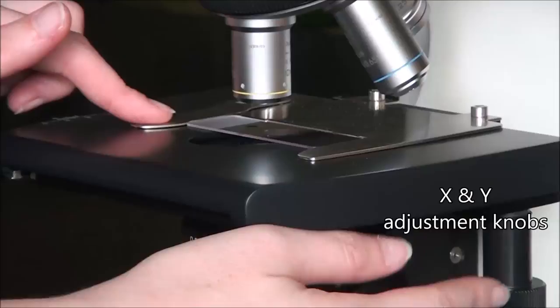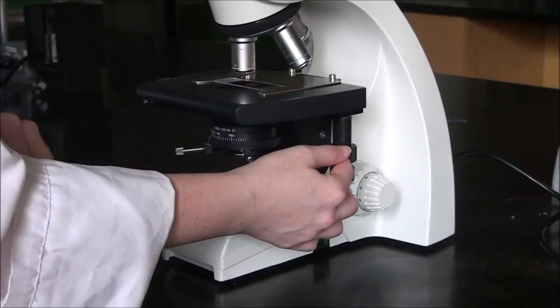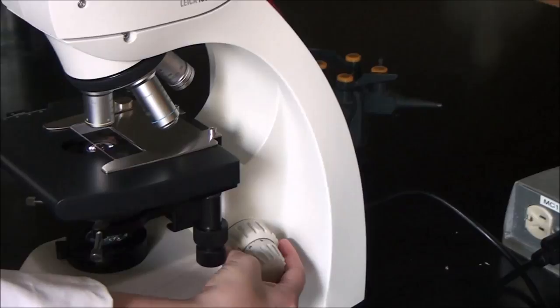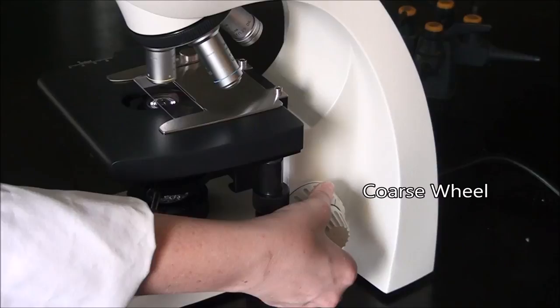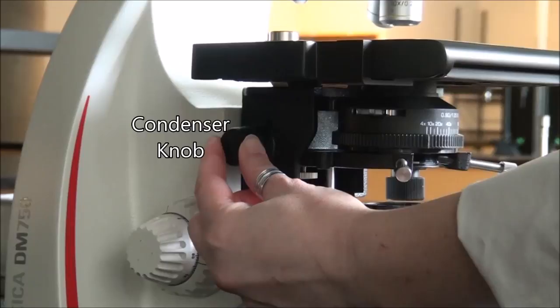Raise the stage to its highest position using the coarse wheel on the right or the left. Turning the wheel away from you raises the stage. We're going to do that until we can't go any further, turning it away from you to raise it to its highest position.